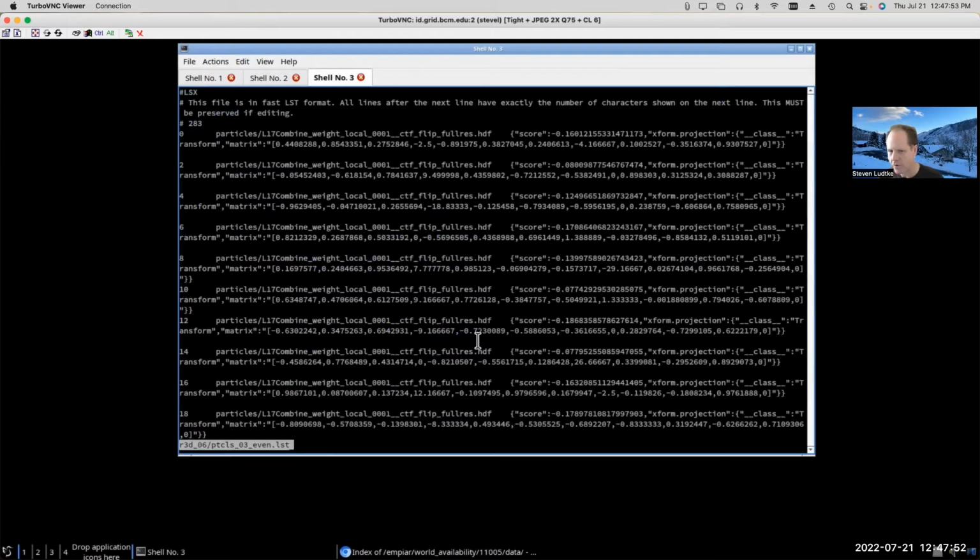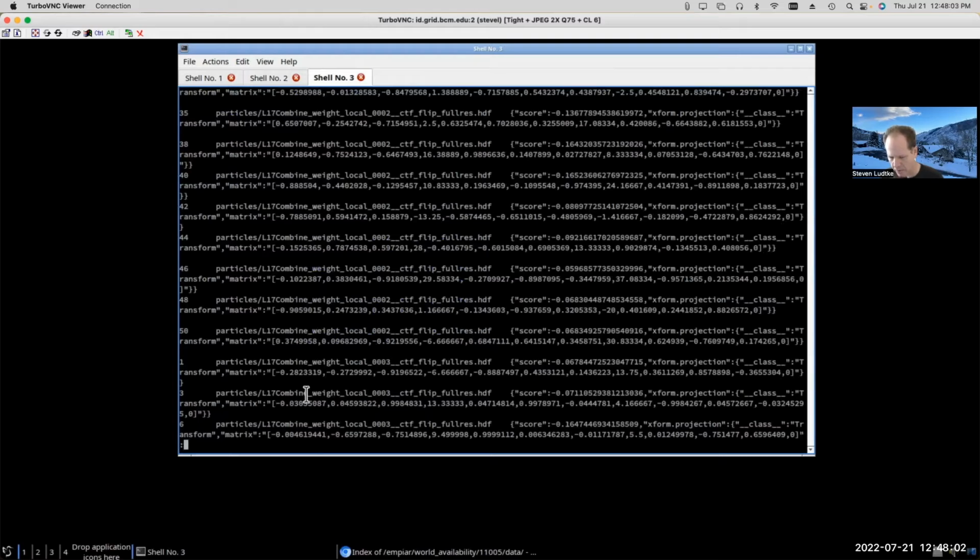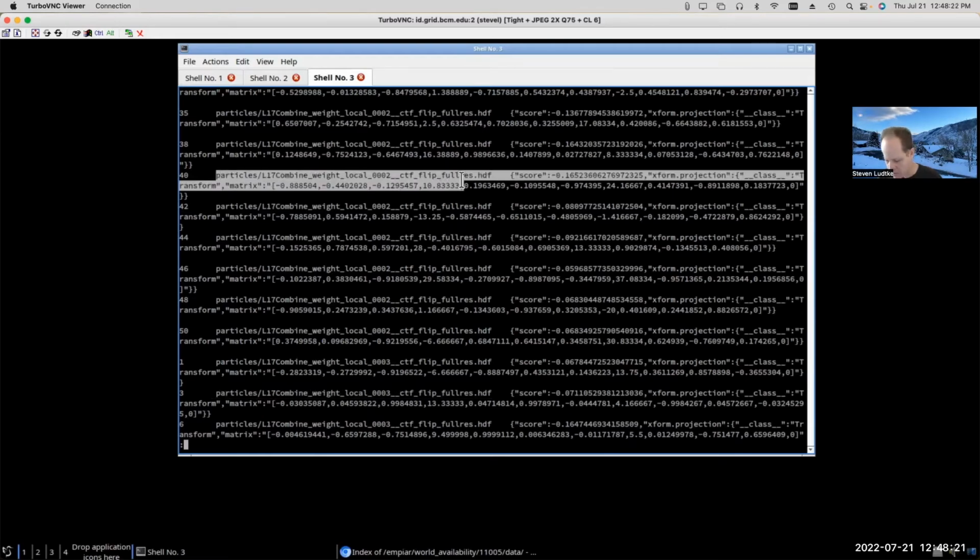Okay, so it looks very similar to the LST file we were looking at before, although now you'll see that the file names aren't, I think, all the same. Yeah, so you can see here that the file names change now. In the other LST file we were looking at, basically there was just one stack file that had all the particles, and there was an LST file which basically just pointed to the same images in the stack file. In this case, the LST file is combining data from a bunch of different image files.